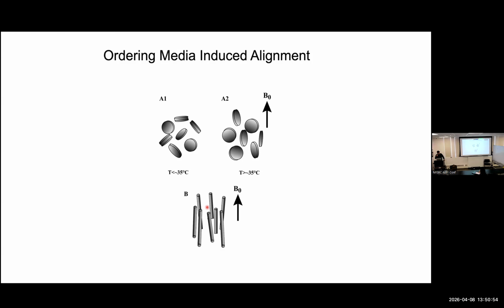In addition, imagine my bilayers are negatively charged. I can dope my bilayers, by the way, with positive lipids or negative lipids. And say your protein is charged. Now you risk, depending on your perspective, that you might stick to it. You're a protein, you stick, and by the mechanism you mentioned, if you stick to me and I am aligned, you're getting aligned, right?